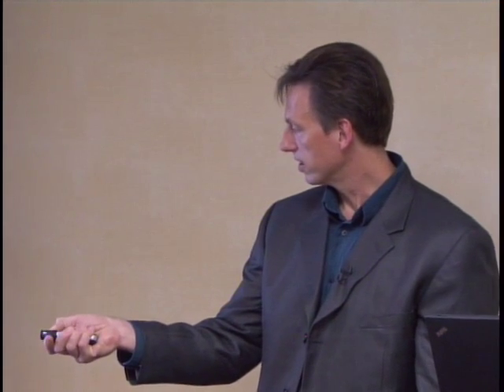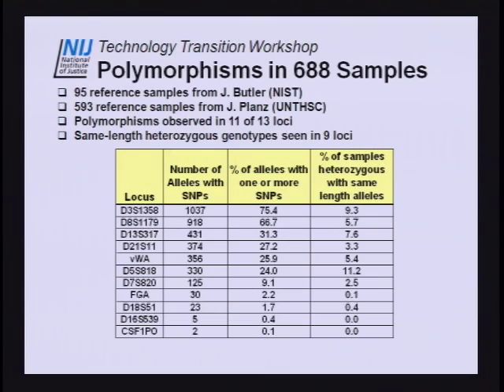Some of these are actually just arbitrary, depending on which one was called the reference at the time the allele structure was used to design a database, because here we have more than half polymorphic. We could just turn that around. But in each case, we've seen both the reference and the polymorphism. So it's not just a naming thing.